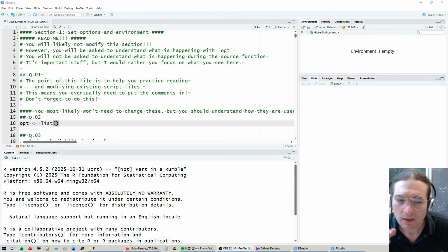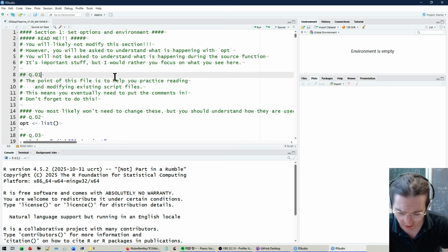Hi. In this video, I am going to talk you through our pipeline. Now, a couple of things to point out. The pipeline for this project currently has a bunch of information censored. I'm going to talk you through it, so you can come in and review this if you're really just getting stuck during the annotation activity.